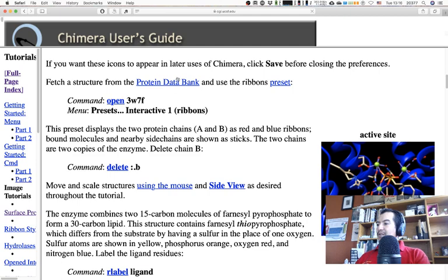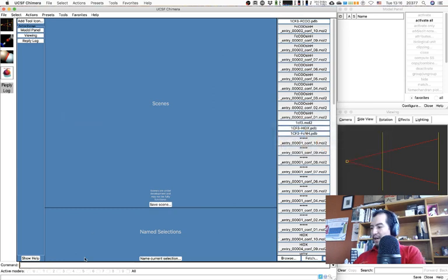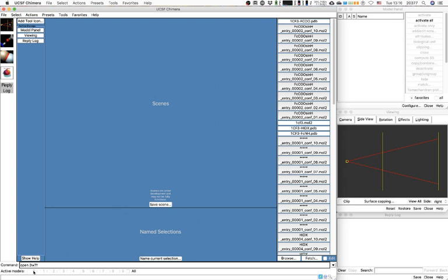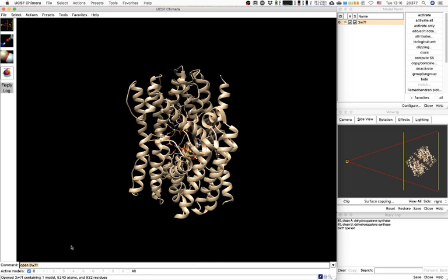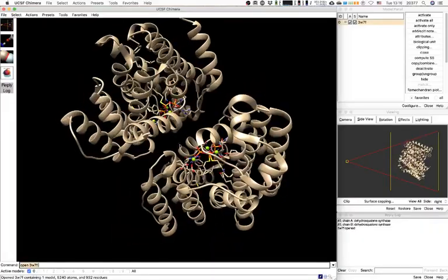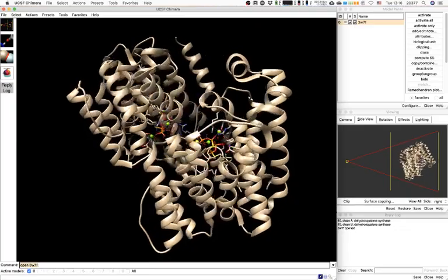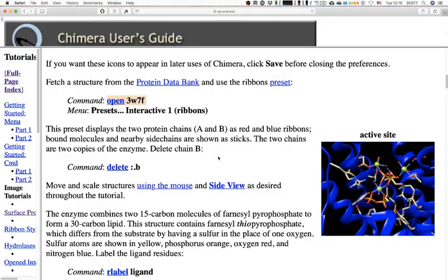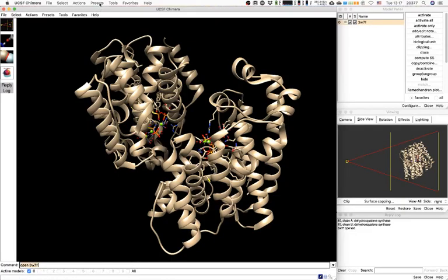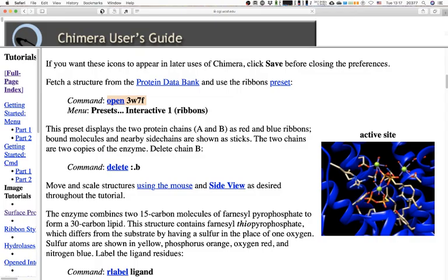I already saved and now let's get the first structure. I'm going to copy-paste and open 3W7F right here in the command line. There we go — this structure looks pretty amazing. I think it's a dimer; you can see the separation between the chains and the pigment right there in the center of the molecule, in the active site. The tutorial wants us to go to Presets > Interactive 1.